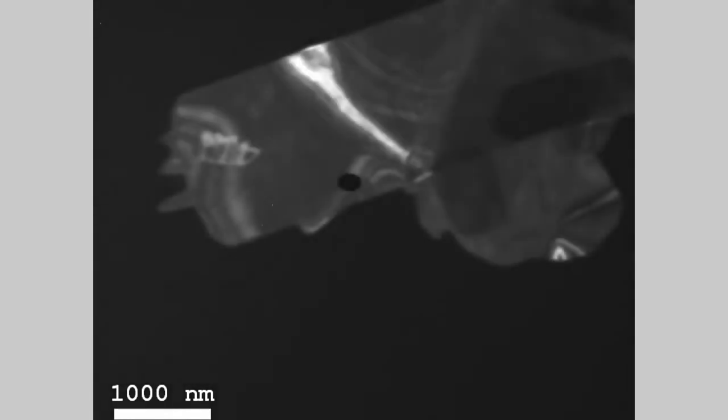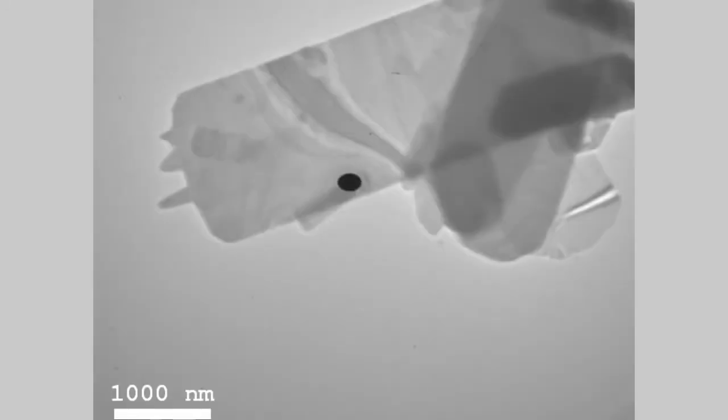So this is the dark field image. Here the white represents those electrons that were diffracted into that little aperture slot that we selected. Here is the standard bright field image again. I told you that the contrast in the image could be enhanced by putting in the objective aperture. We can try that. You see?